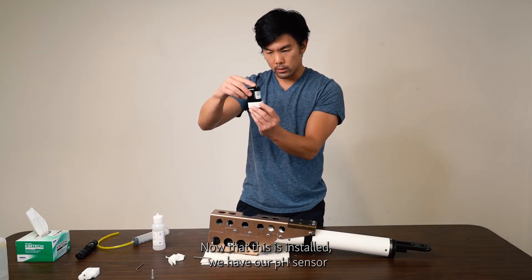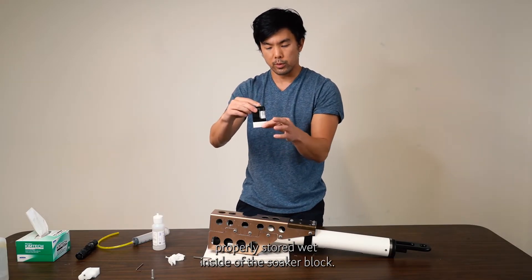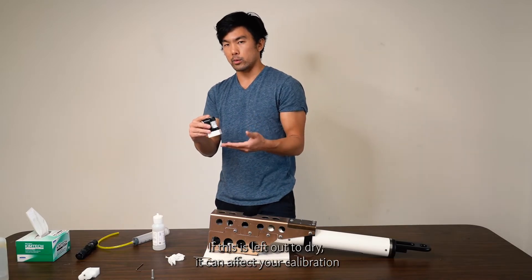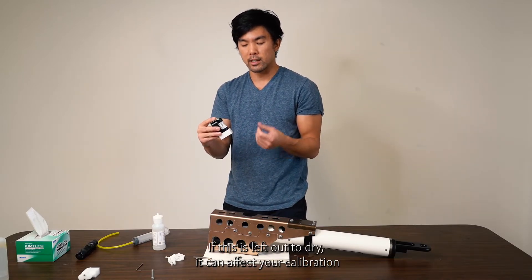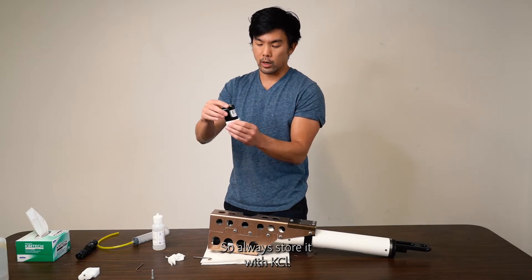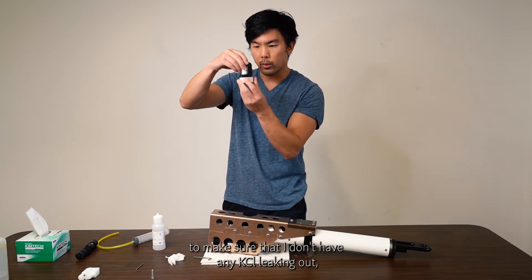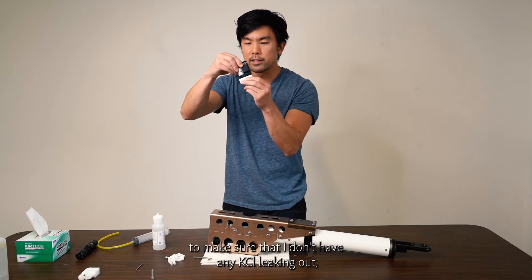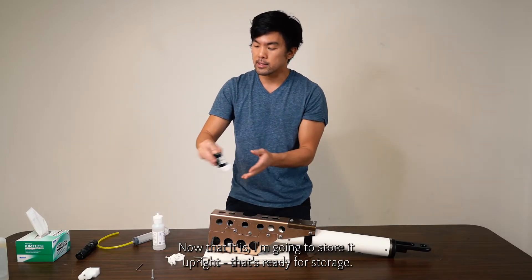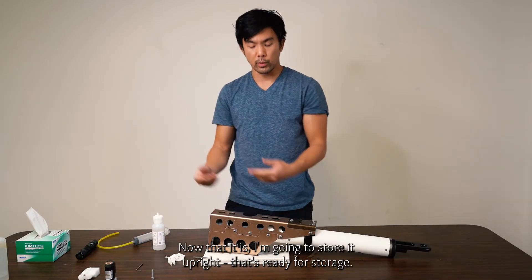Now that it's installed, the pH sensor is properly stored wet inside the soaker block. If left out to dry, it can affect your calibration and potentially damage your sensor, so always store it with potassium chloride. Inspect to make sure there is no potassium chloride leaking out and that the sensor is snug. Store it upright for regular storage.